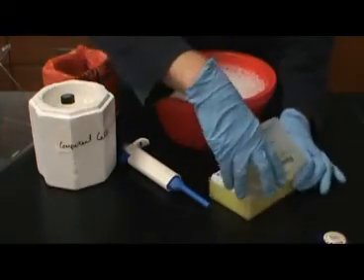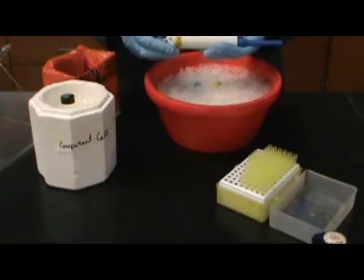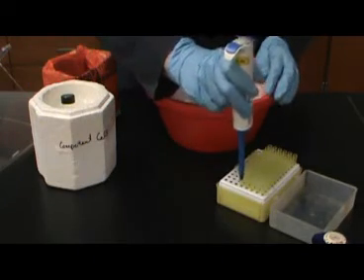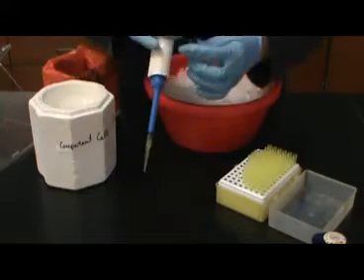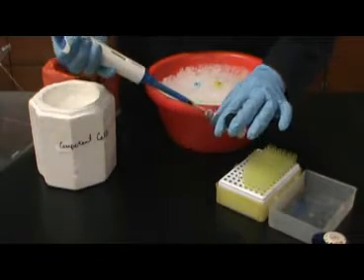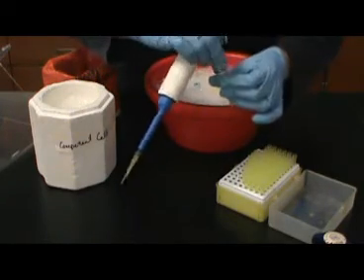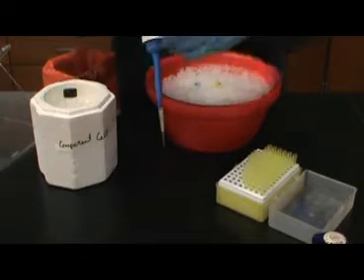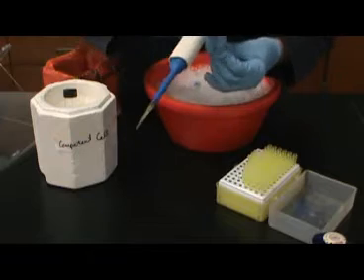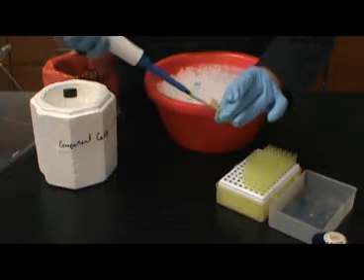Once the competent cells have been introduced to the plasmid in the positive DNA tube, the uptake of the extraneous DNA will begin. This is the process known as transformation. In this case, the plasmid being taken up is pUC18. pUC18 plasmids contain a gene for ampicillin resistance. This E. coli in its standard or non-transformed form is susceptible to ampicillin antibiotic. However, the pUC18 plasmid will introduce the gene for ampicillin resistance. This will allow the E. coli cells after transformation to grow in the presence of ampicillin. They will be resistant to ampicillin.